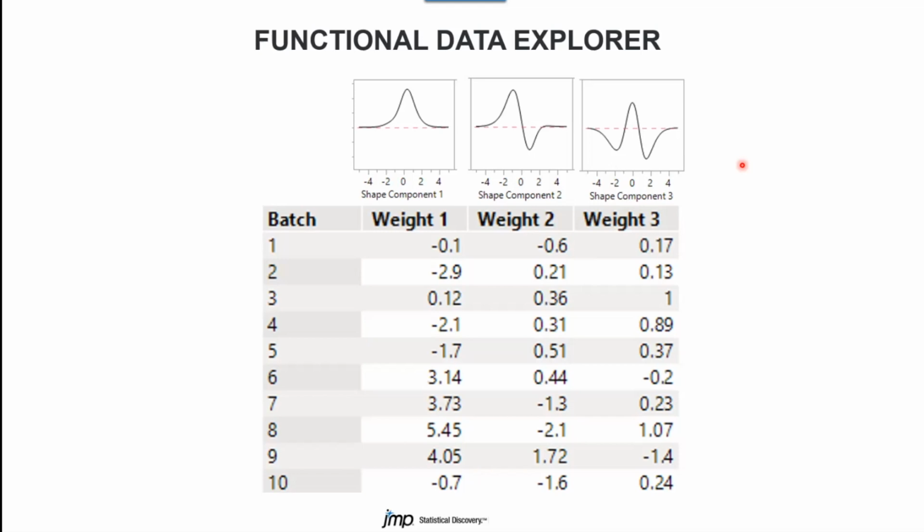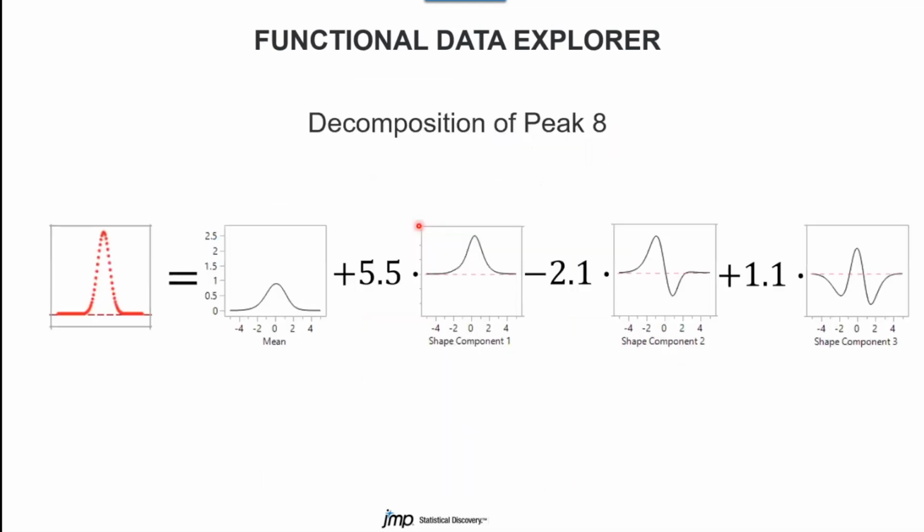What we do more often is we model these responses using least squares models. So we use the DOE factors as predictors to predict these shape components. And then we come up with a model where, instead of having the weight in the model, we use the linear model that predicts the first principal component here, the second principal component's linear model here, and the third one's here.